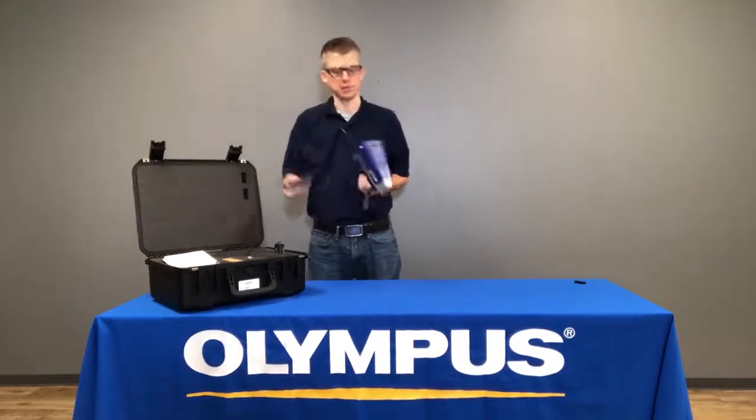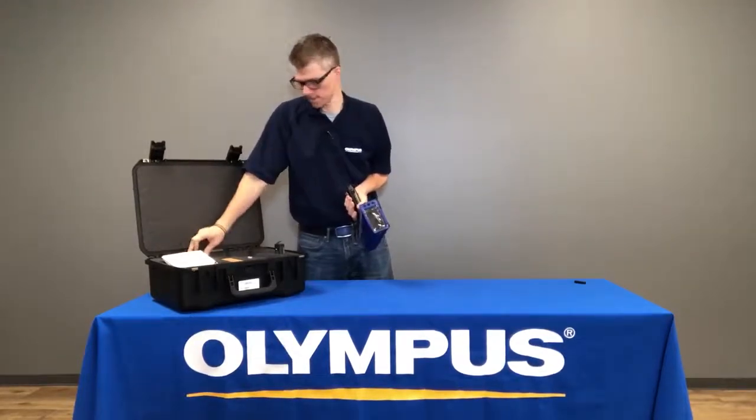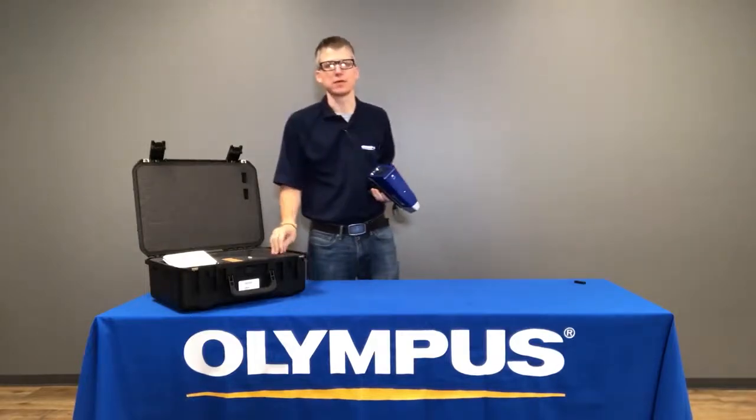The Vanta comes with two batteries. You can place one battery in the handle with the battery cap, and keep the second battery as a spare.